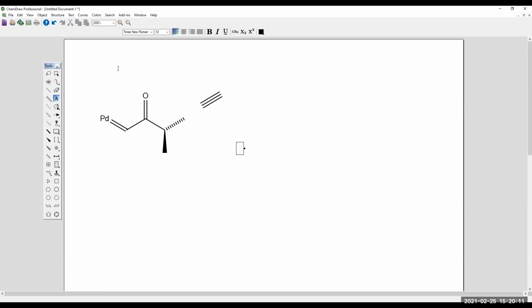All right, so a couple more things before we go in and actually draw a structure. So the eraser tool. So we're all drawing, right? Just like when you're typing in Word or something, you might make a little error, a mistake, a typo, something like that. There's a couple different ways to get rid of those.